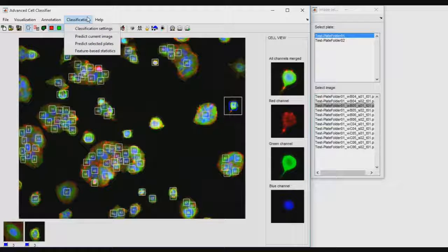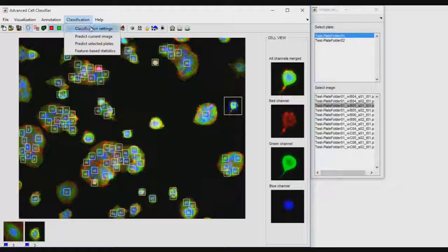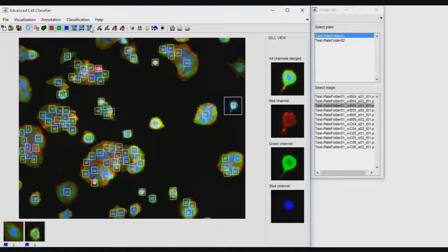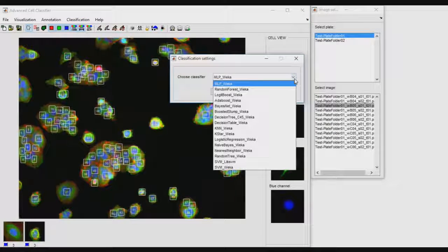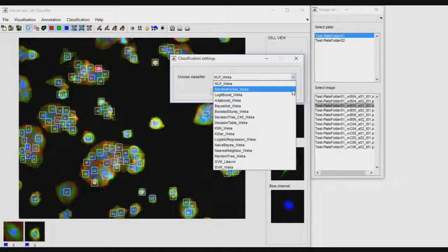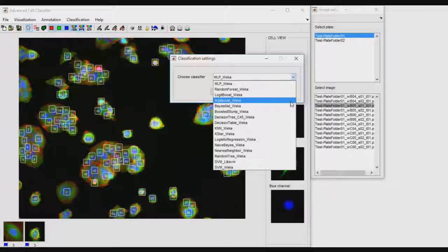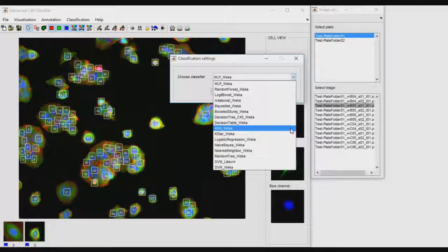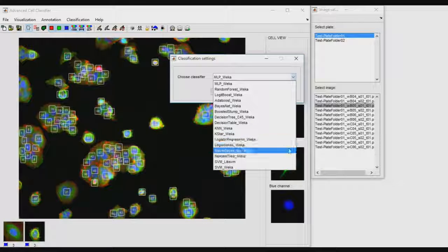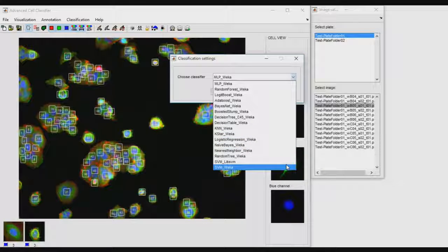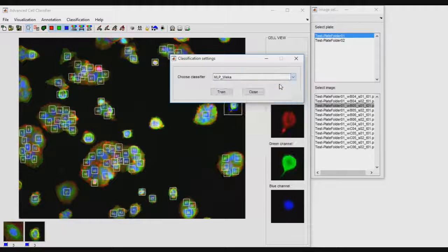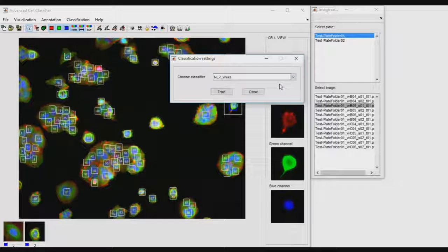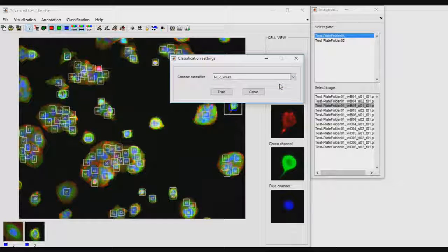Once classes of interest have been defined, to automatically classify non-annotated cells, users may train one of the 16 classifiers available using the classification settings buttons. Typically, the multi-layer perceptron, also called artificial neural networks, provides reliable results.